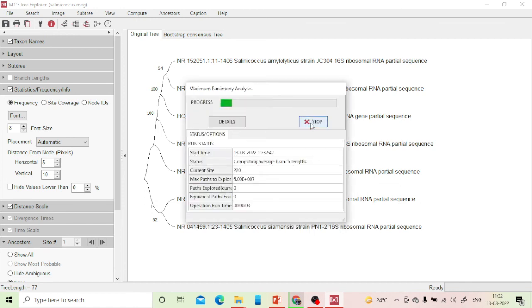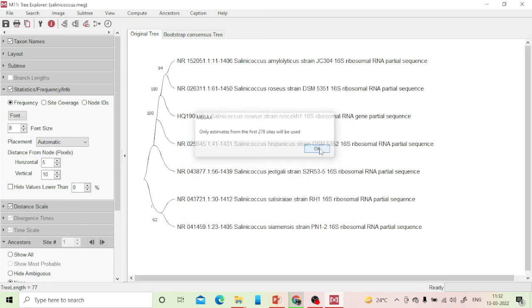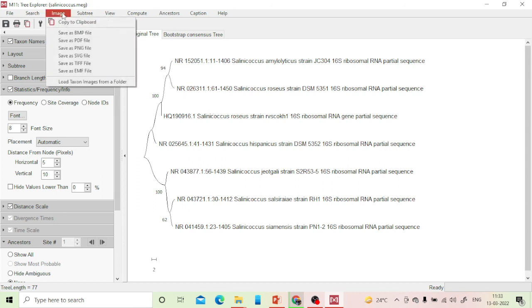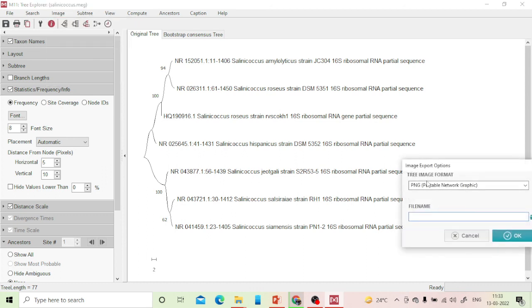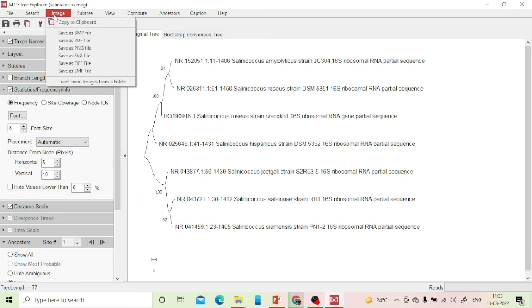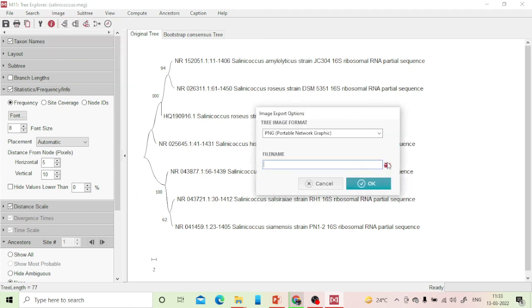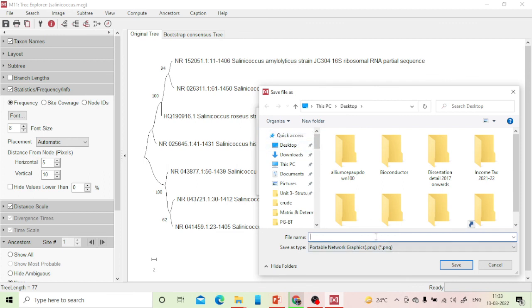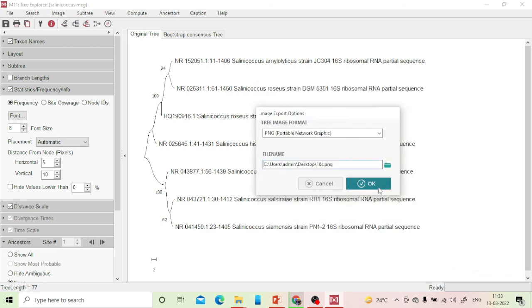The tree is in front of you and you can export it for publications. Go to 'Image' and save as PNG or any other preferred format. Select the save location — for example, the desktop — give it any name, and click Save.